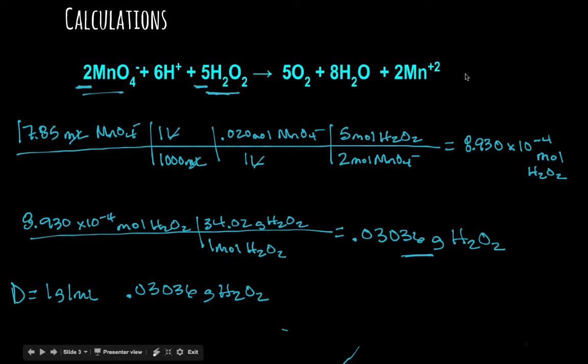That was what was in our sample, that's what we just calculated, divided by 1 gram of H2O2 that we analyzed. So this number on the bottom is going to be the grams of sample that you analyzed. So this is the milliliters, and since 1 gram equals 1 milliliter, I'm just changing that unit to grams there.